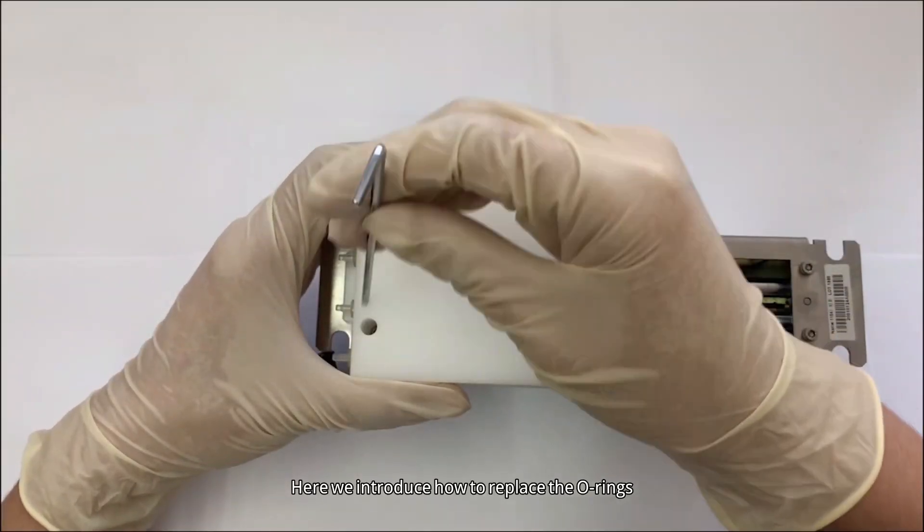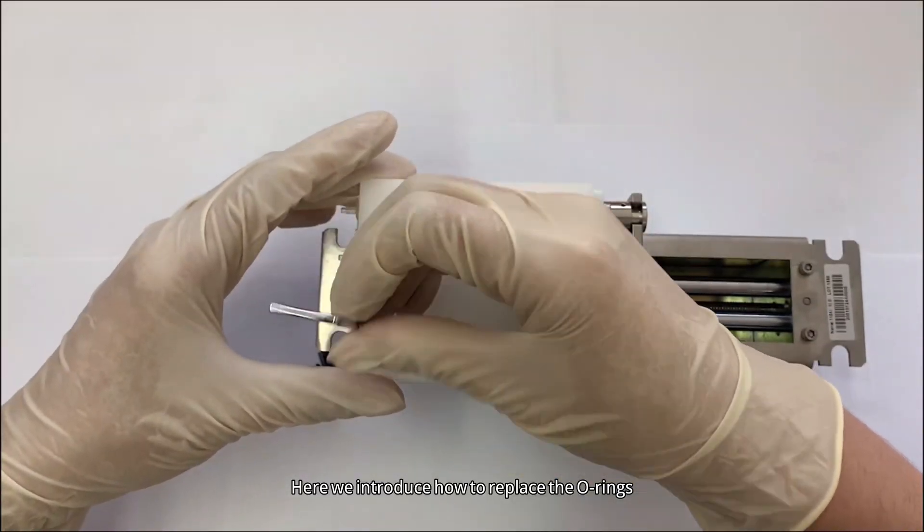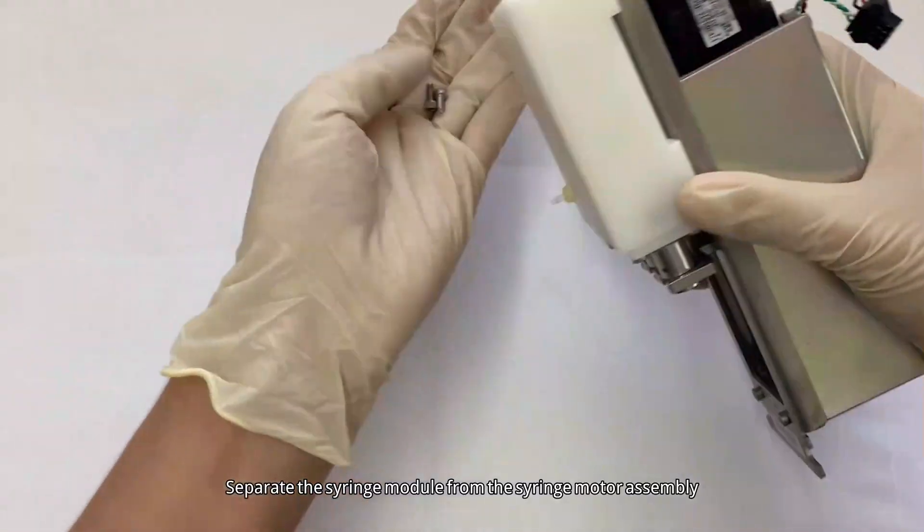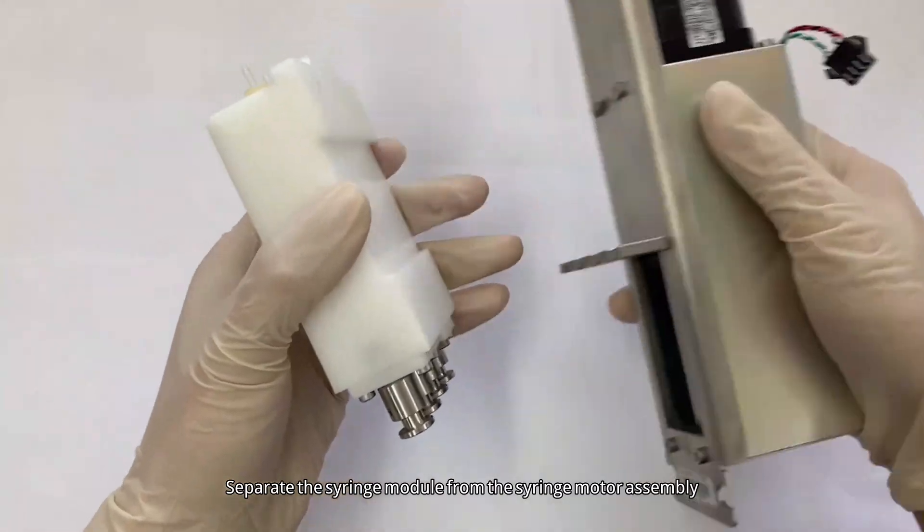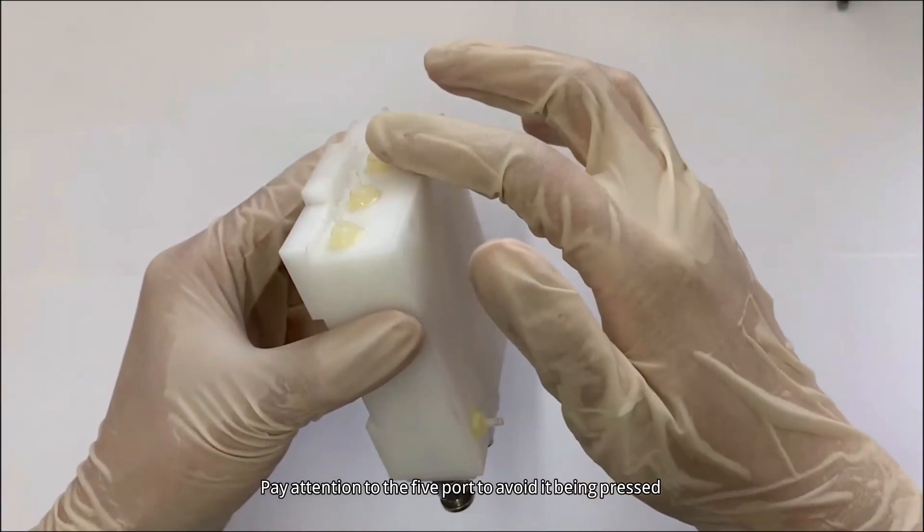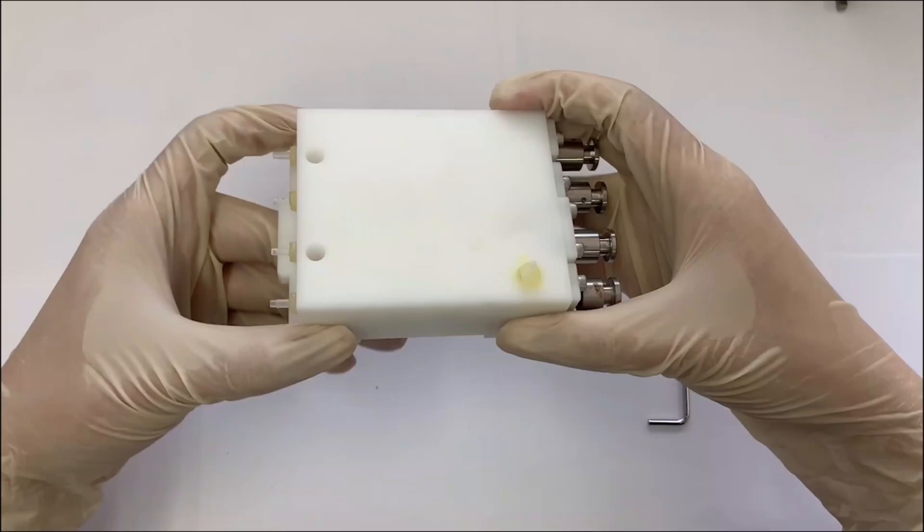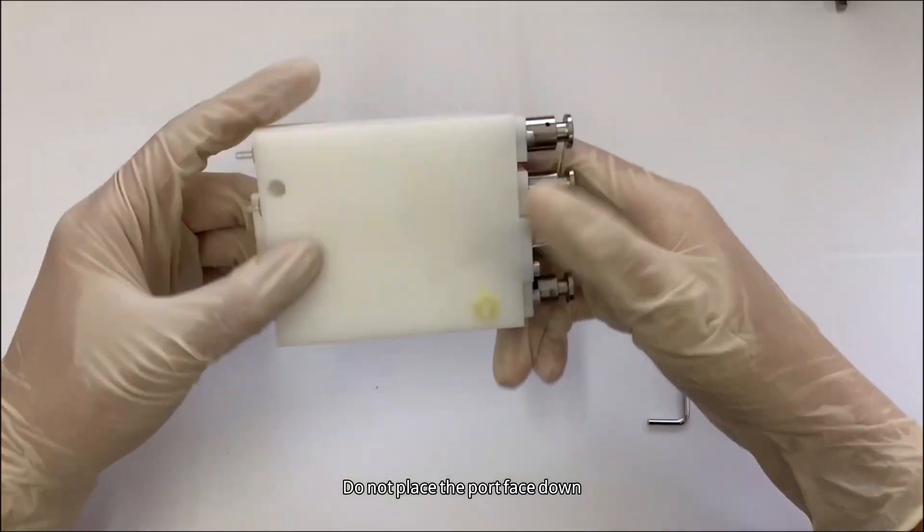Here we introduce how to replace the O-rings. Separate the syringe module from the syringe motor assembly. Pay attention to the 5-port to avoid it being pressed. Do not place the port face down.